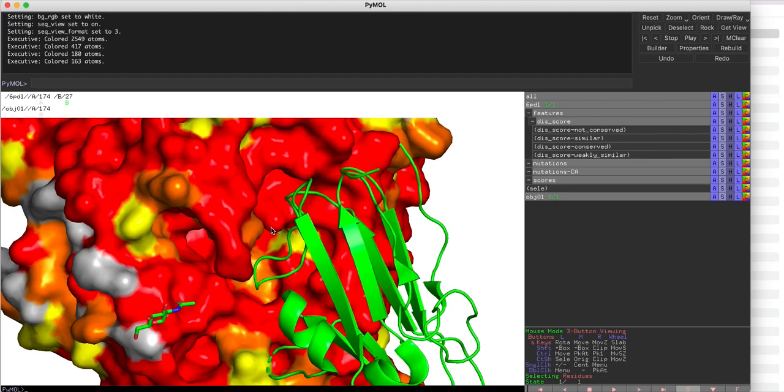They may use a similar mechanism to attach themselves onto the human receptor. This gives us a hint that there is a possibility of designing a common agent to disrupt the attachment of Hendra or Nipah glycoprotein to human receptor.